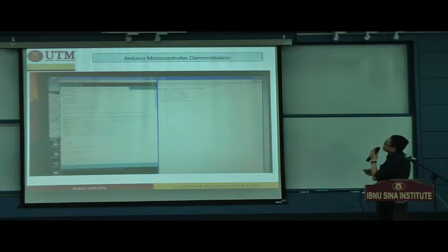So we can see that we programmed, you can probably see it very clearly here, system initialization, stream cleaning, injecting sample solutions, flushing the chamber, and performing the complete extraction procedure. So what we do is just key in the number over here.